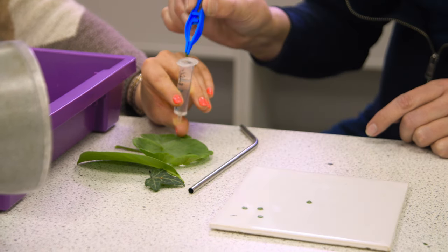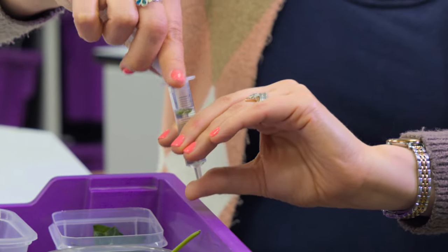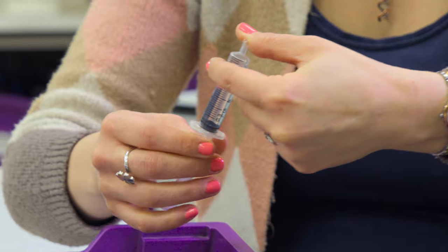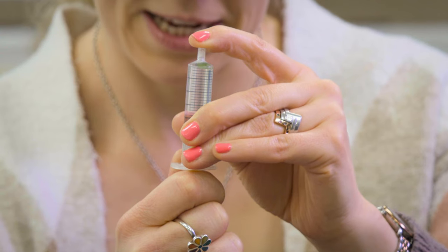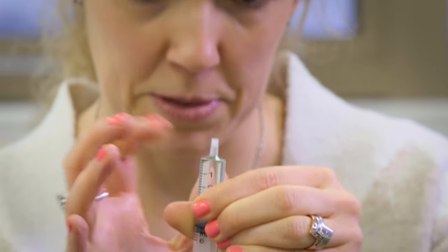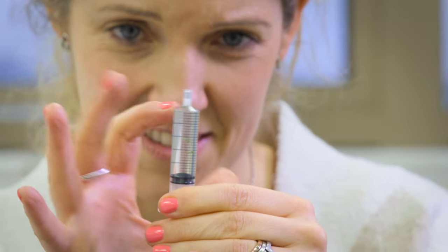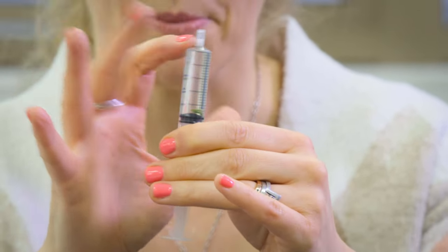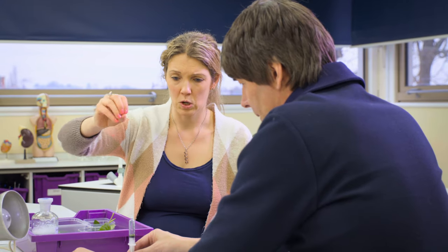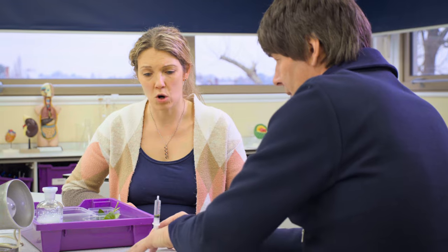Pop three leaf discs in and then put the plunger in. This is the tricky part — make sure your students have goggles on for this. Then you want to get rid of the air: put your finger on the top, pull down. You're forcing the air out of the leaves, making them denser. Then tap. This is the bit where you have to be persistent. They should start to sink. You could put it in a clamp stand with a boss and a clamp, or you can just leave it on the white tile.